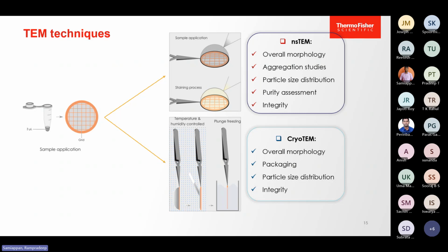That's it, 3 microliters, but concentration plays a very important role here, be it a liquid form or suspended in a liquid. We need an optimal concentration. I can tell you an approximate amount for different samples, but that's a rough estimate. We have to identify the concentration level for our sample of interest.